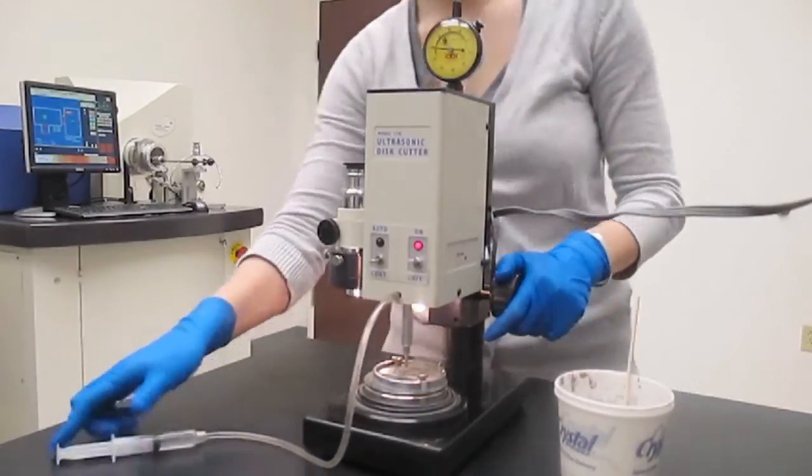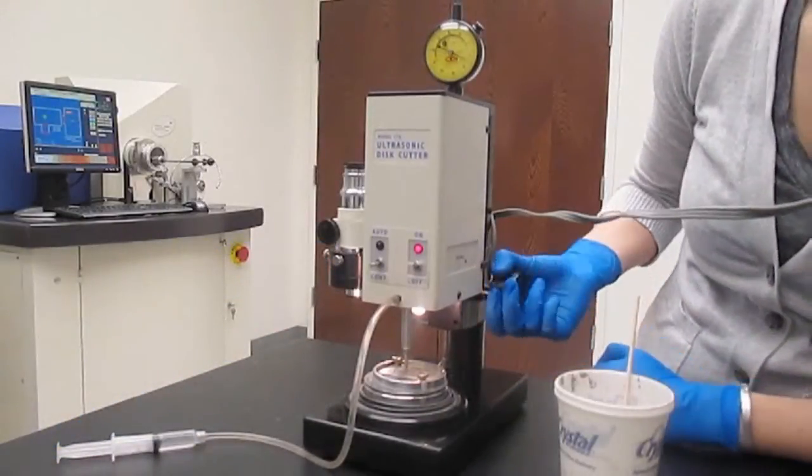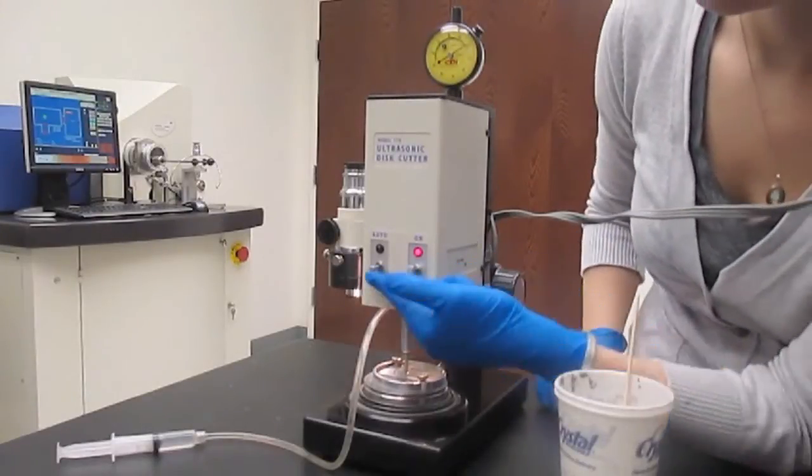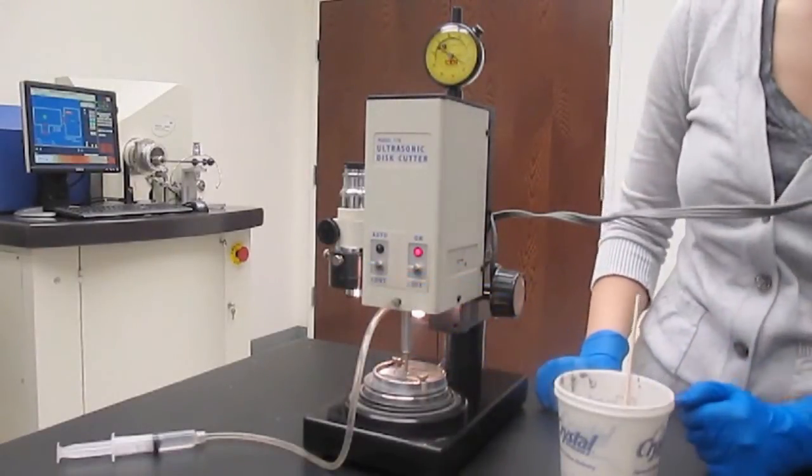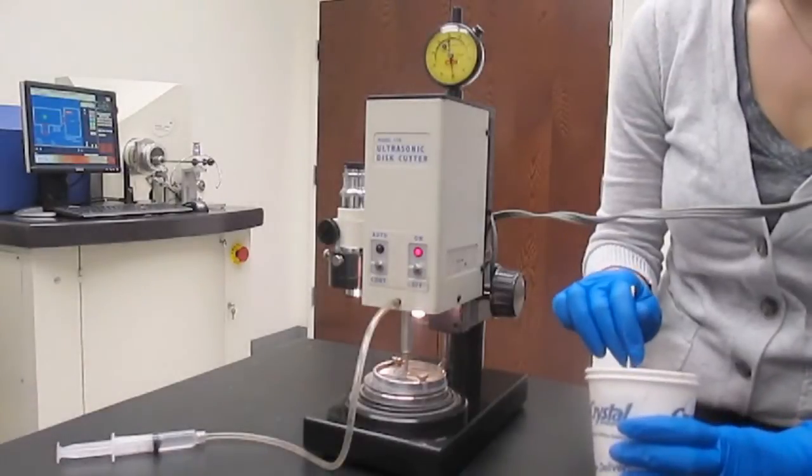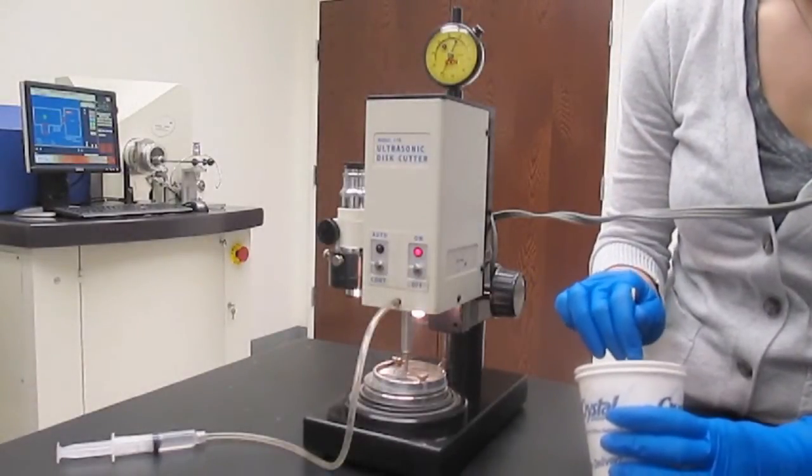Lower the cutting tool until it touches the silicon carbide paste on the surface of the glass. Continue to lower the tool until the stage is slightly compressed. Move the ultrasonic transducer switch to the auto-termination position. Cutting begins immediately.